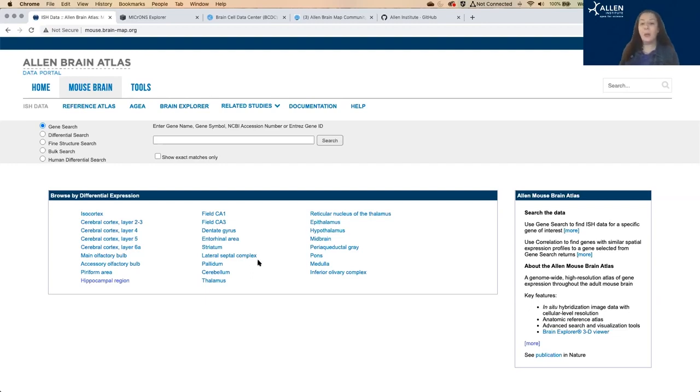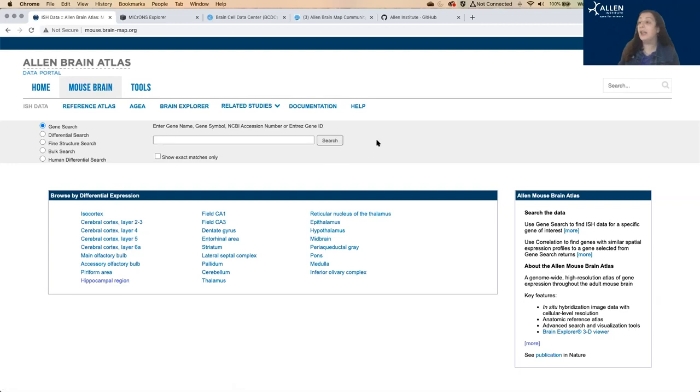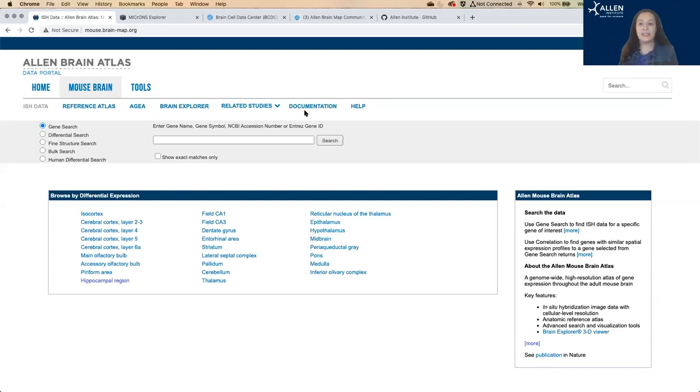For the details on how we developed those ISH methods and collected the data, go ahead and check out this documentation link, and there's detailed papers that explain that in-depth, so that you could replicate it yourself if you wanted to.